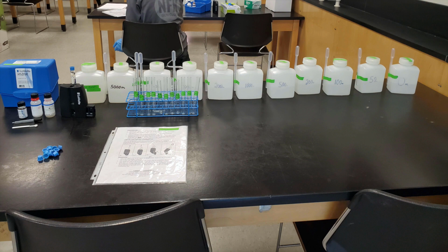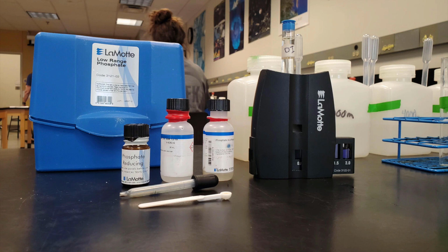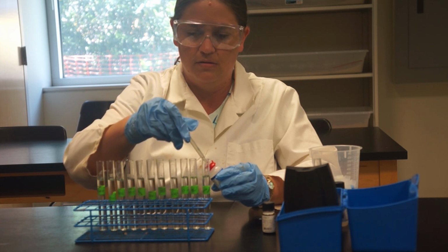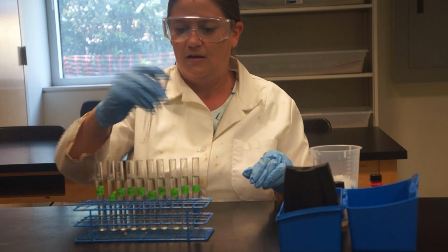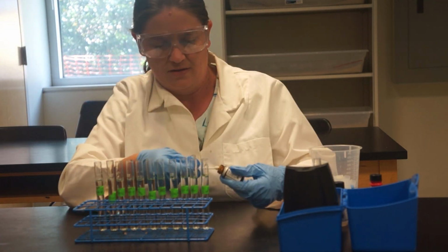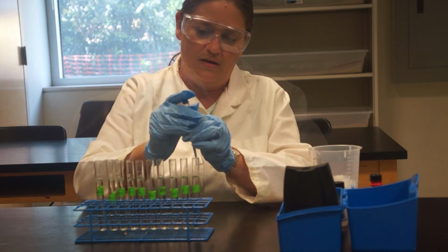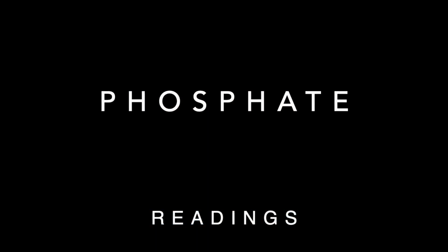Next, we will use the kit that you see on screen to find out how much phosphate there is in the water. This works by reacting with the phosphate in the water and changing color based on how much phosphate there is. Here, we follow the instructions provided with the kit, which works like a recipe. Add 10 milliliters of the water sample, 1 milliliter of phosphate acid reagent, mix it, then add 0.1 grams of phosphate reducing agent, mix it again, wait 5 minutes, and voila!